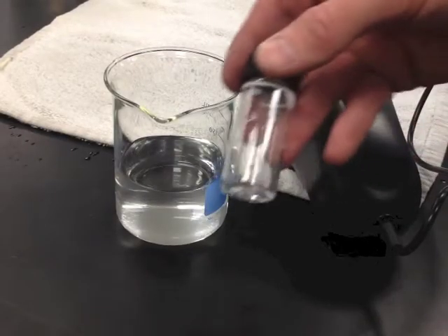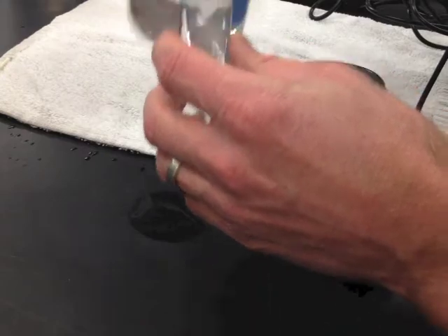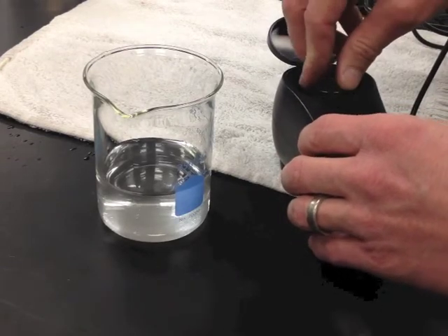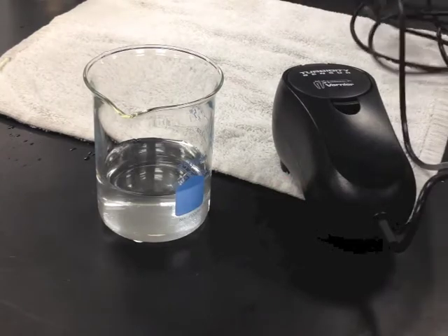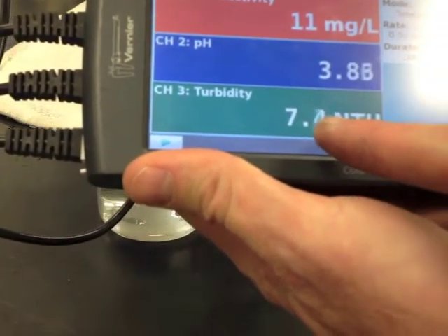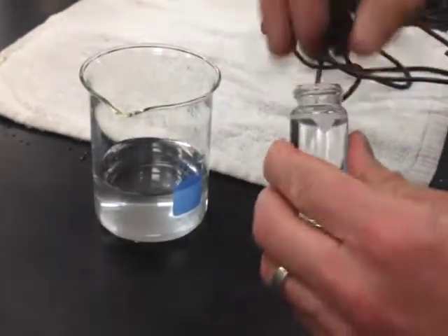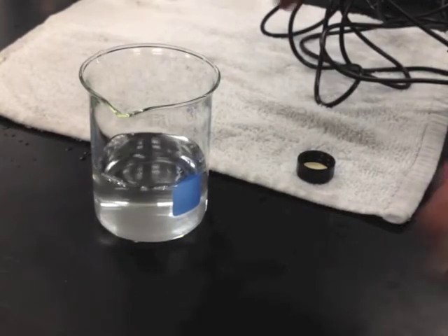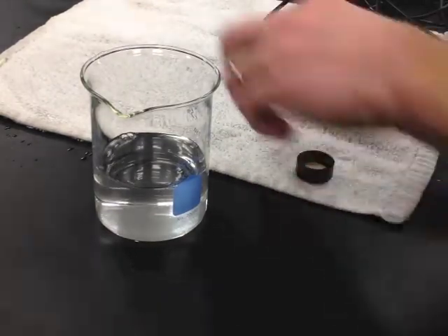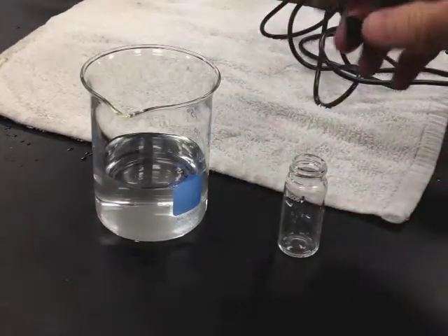When you use the turbidity sensor a second time, all you need to do is take your clean cuvette, transfer your water sample to it, and take a reading — you will not have to calibrate it anymore, as it's already been calibrated. Unless you unplugged and re-plugged the machine or turned it on and off. Pour the cuvette contents back and rinse the cuvette with pure distilled water so there's no residue from the previous sample. Let it sit ready for the next sample.